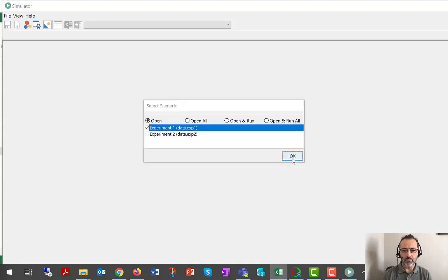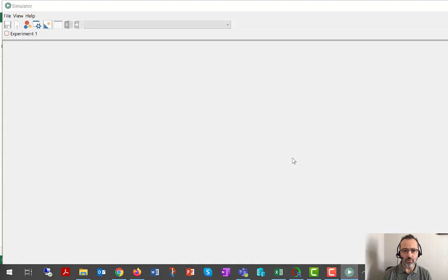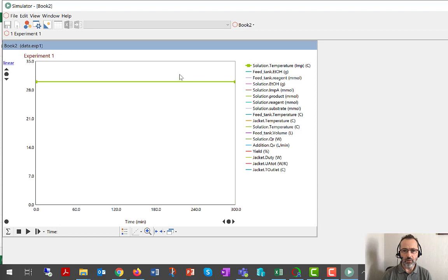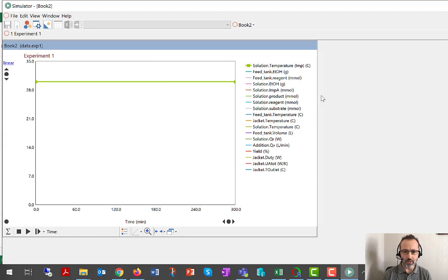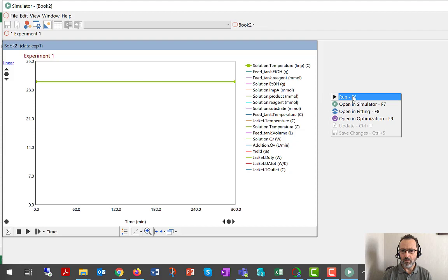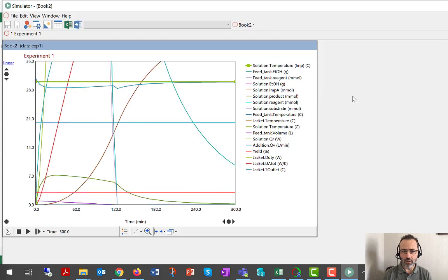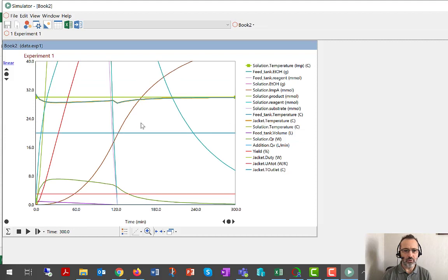Again, focusing on experiment one, we can see, we can rescale, we can see the temperature of 30 degrees imposed. We can F6 or right click to run. We can examine the jacket temperature. It is at or around 30 degrees C.